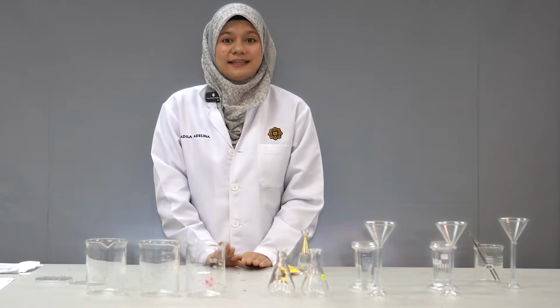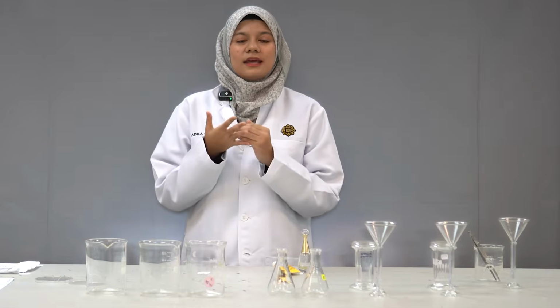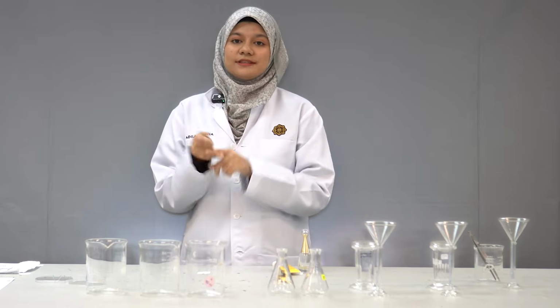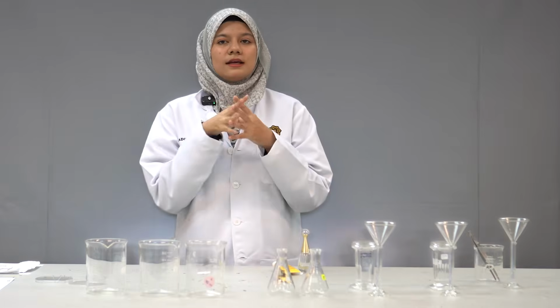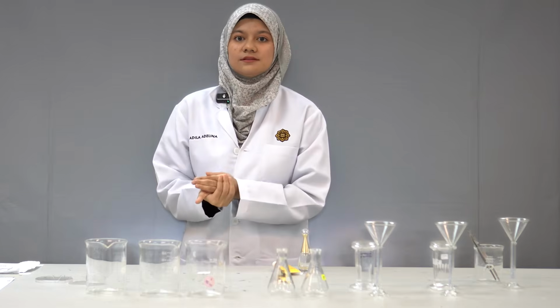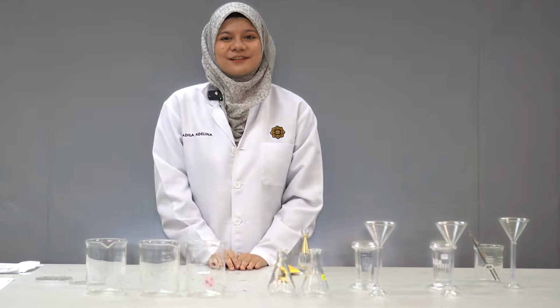Last but not least, in forensic science, we can utilize TLC to identify unknown substances that we find at a crime scene, such as poisons, drugs, and explosive residues. It is very valuable for forensics as it comes with rapid results that can help with the further investigation. So that's all from us.